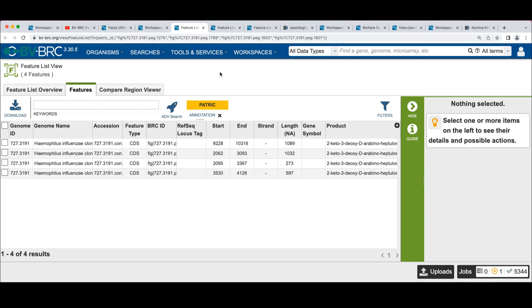or that it's really slow. Yeah. Yeah, we may not be indexed yet. So this is the one in the example, and it's owned by Rebecca, and I don't know if we made... We probably didn't share that to everybody.